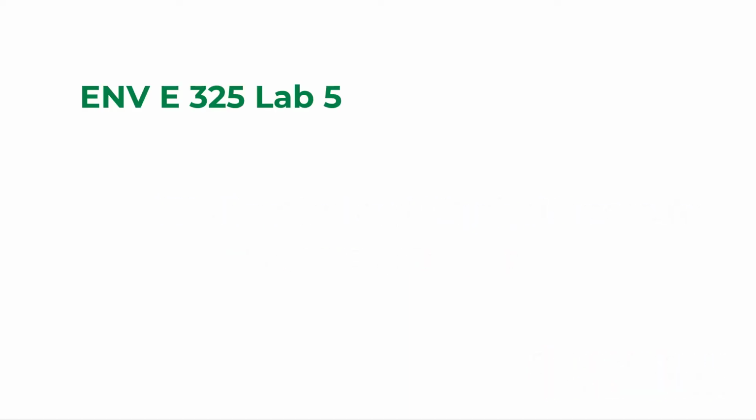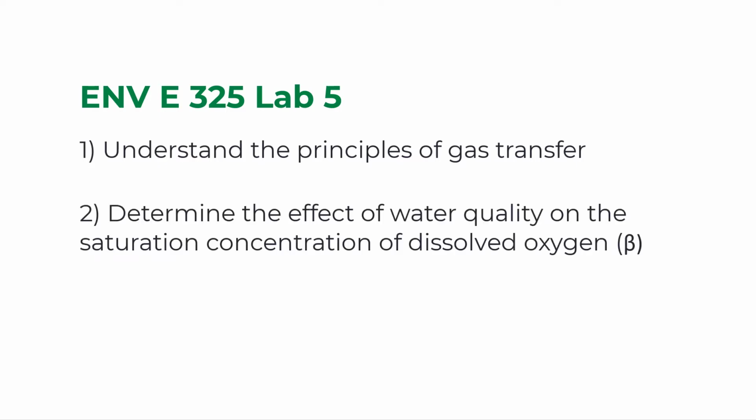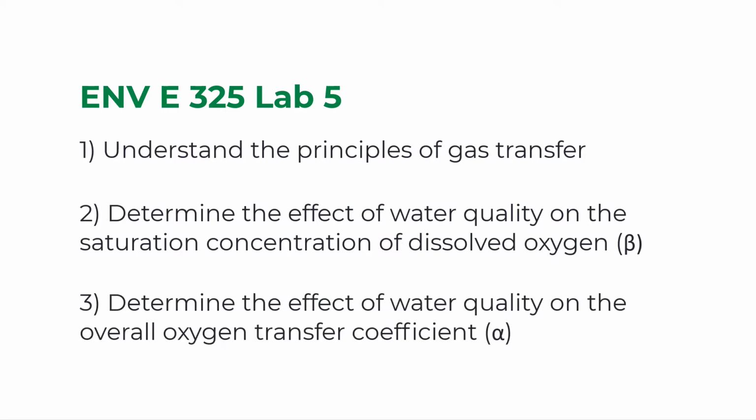Hello everybody. In this lab, our objectives include: 1. Understanding the principles of gas transfer. 2. Determining the effect of water quality on the saturation concentration of dissolved oxygen, beta. And 3. Determining the effect of water quality on the overall oxygen transfer coefficient, alpha.